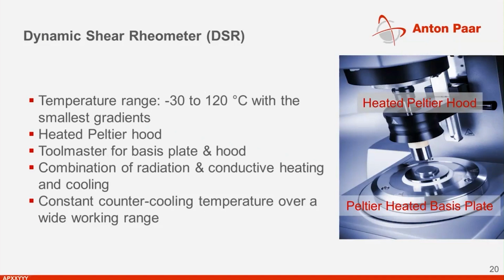Furthermore, the accessories are heated under the use of Peltier elements, so we can heat and cool with these elements. And a combination of radiation and conductive heating is used. For the MCR or the SmartPave 92, there's even no need to have a counter-cooling bath because the Peltier elements there are cooled down under the use of vents.